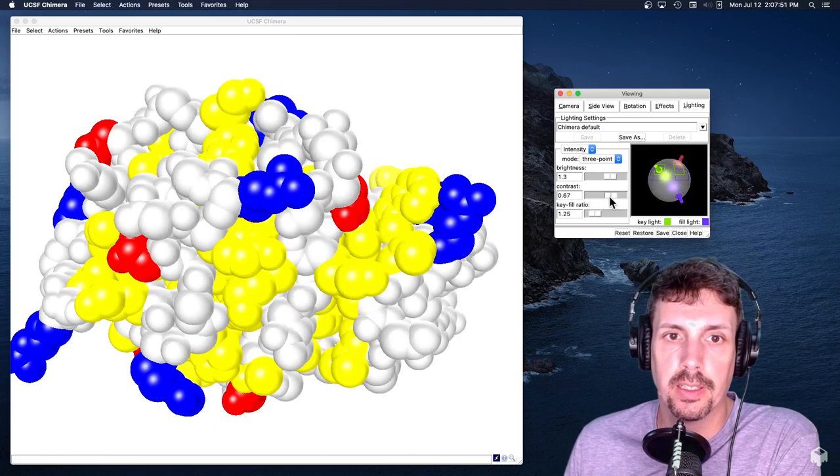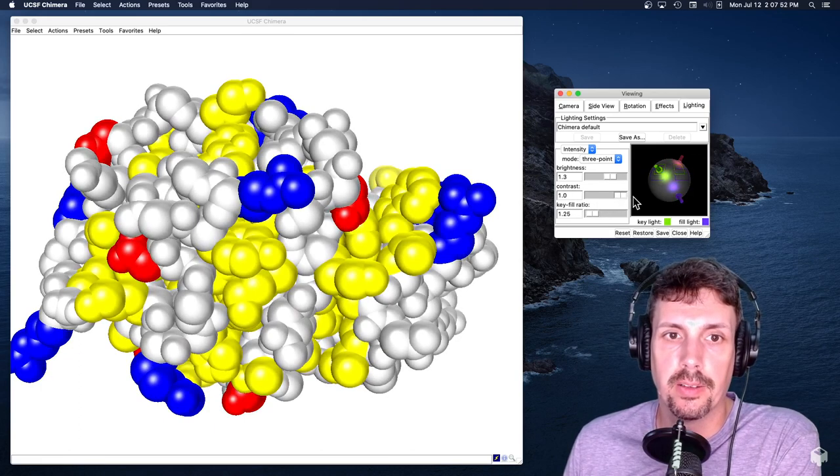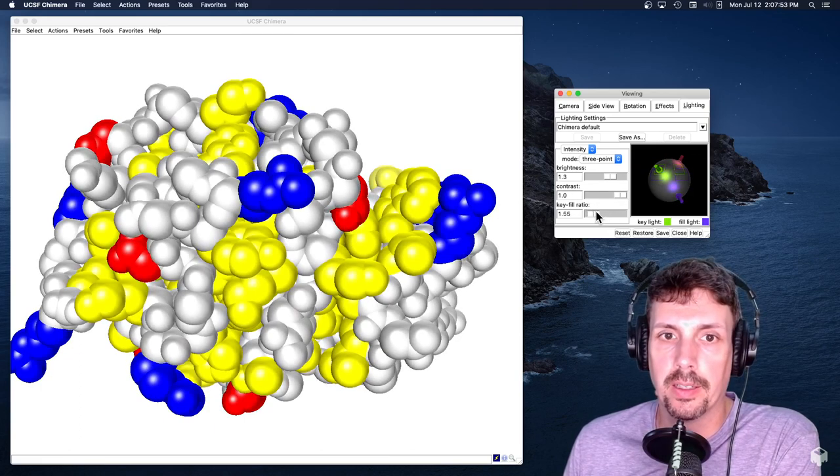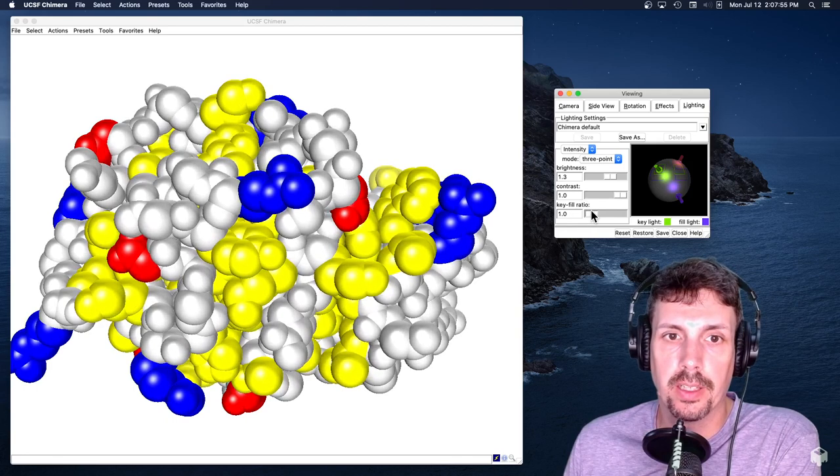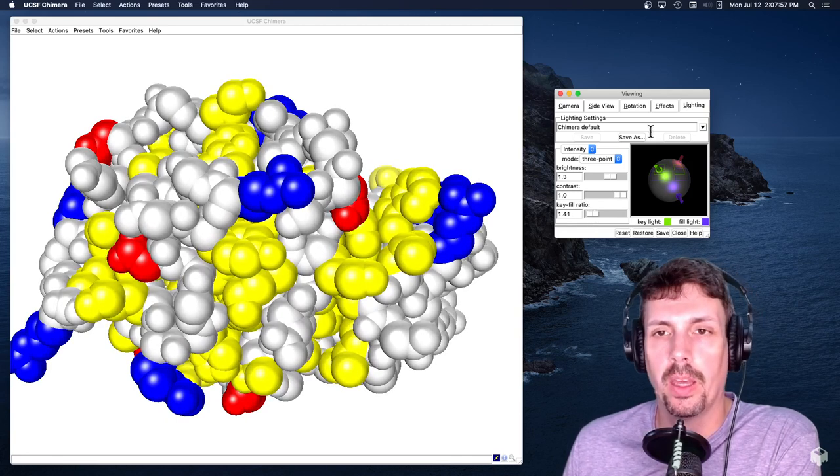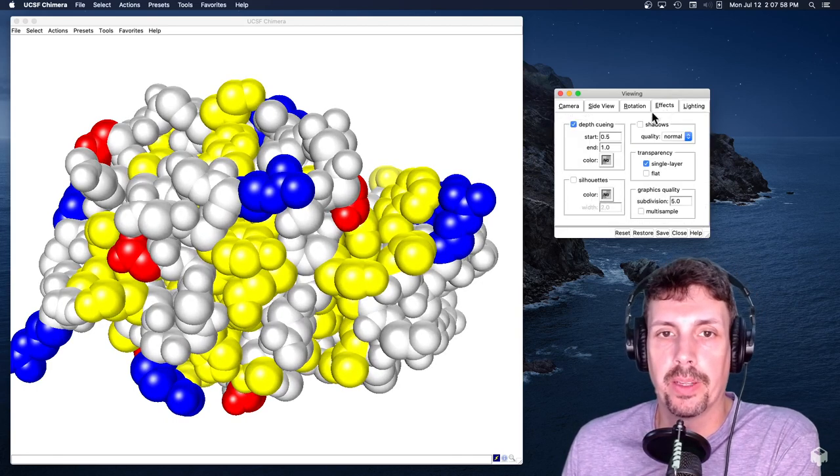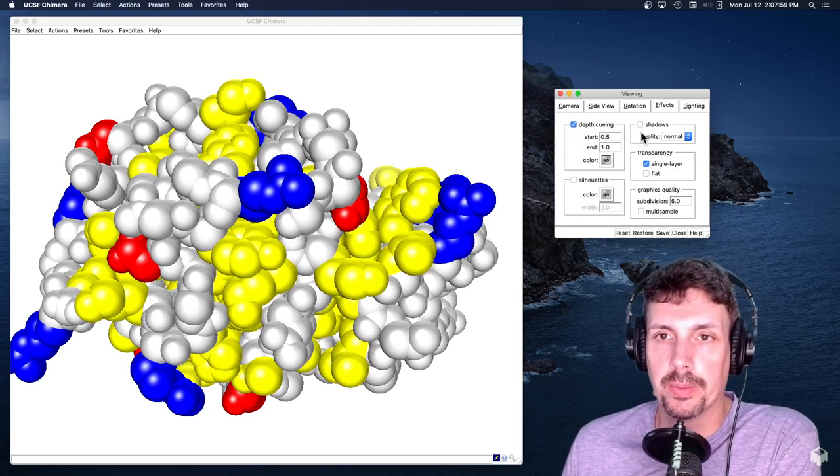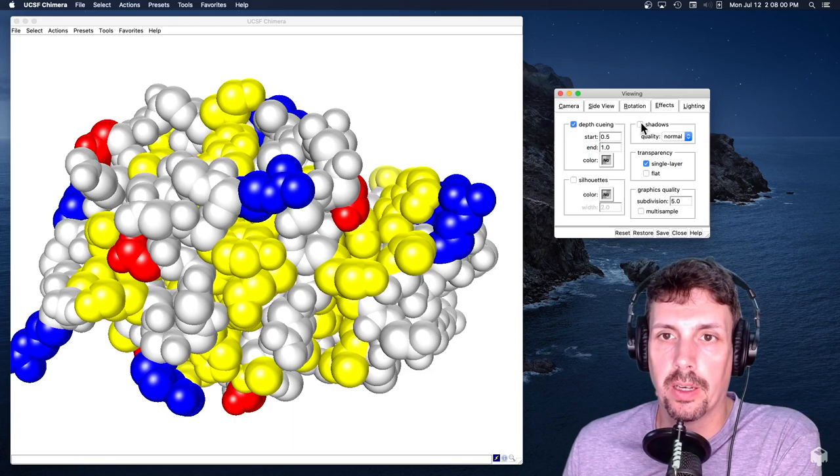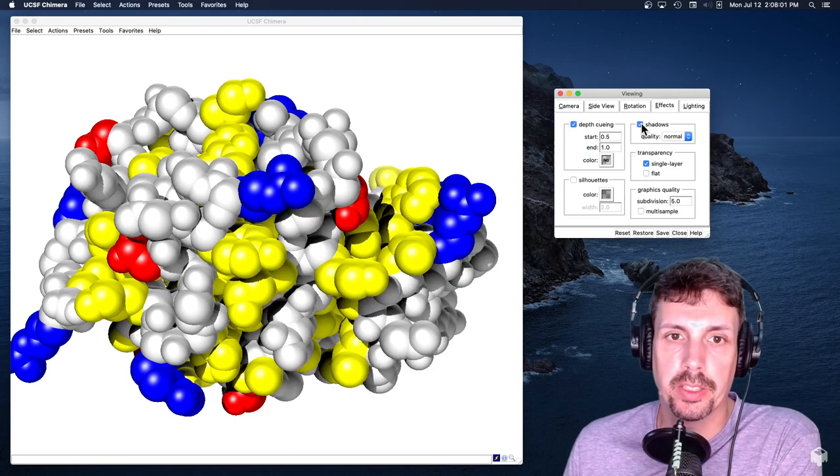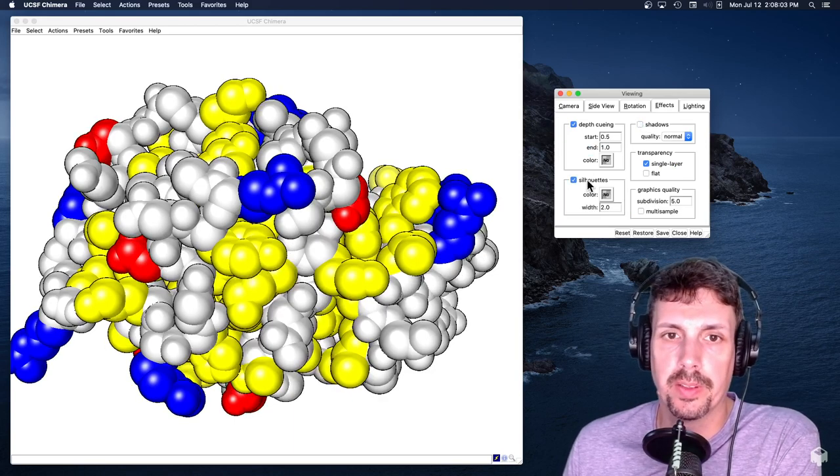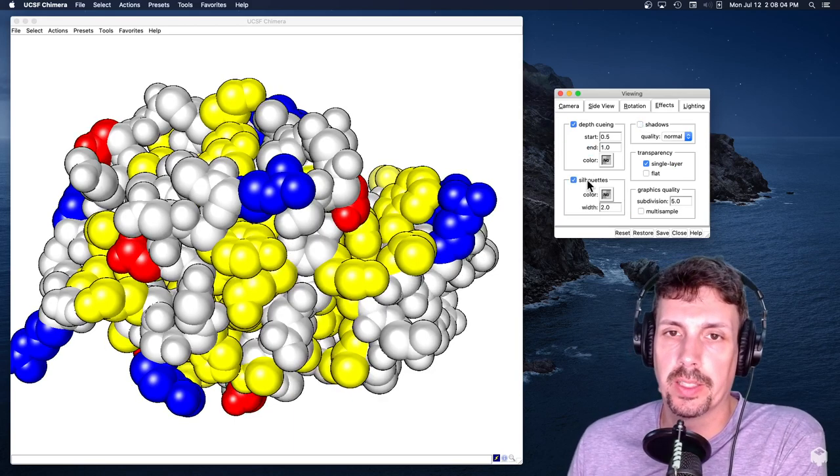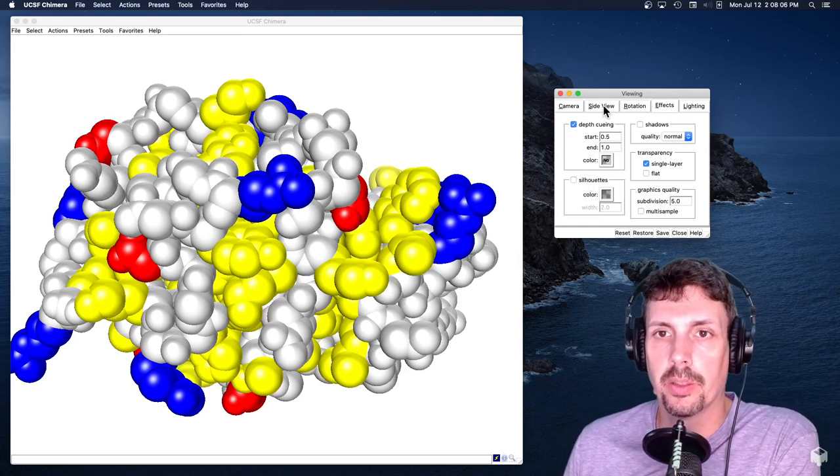You can really kind of get a little crazy. The key-to-fill ratio changes kind of the light source. Anyway, wasting some time here. Add shadows never really worked for me. The silhouettes, which is nice for your final structure, but not a thing.